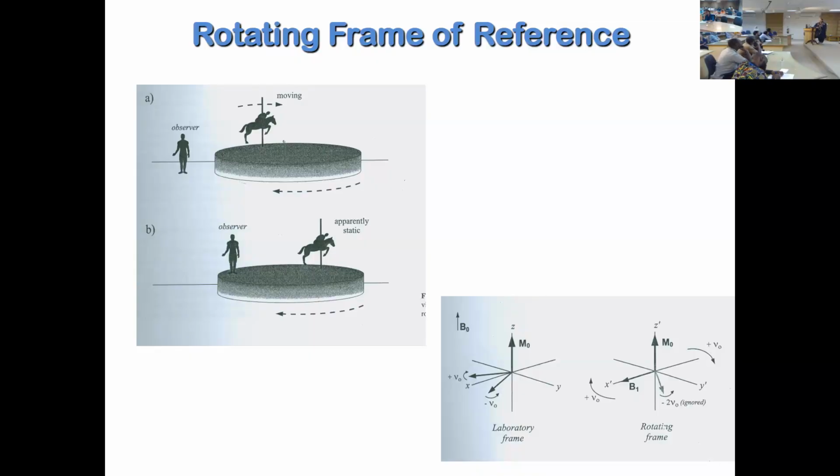So the difference between these two becomes only 1 kilometer. For example, if you are on the train which is moving at 300 kilometers per hour, the other one is at a speed of 301 kilometers per hour, so it only has a one kilometer difference, and when you are inside you could see, okay, this train is moving faster than the train you are in. So this is the concept, because the vectors that we are discussing, all these nuclei, they are moving really fast, with the speed of light.